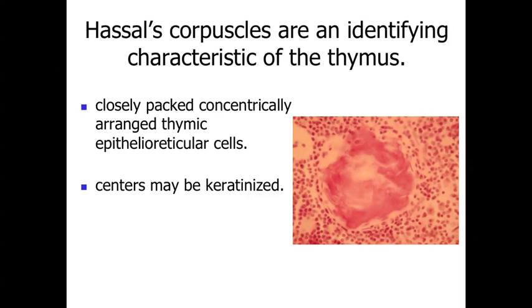One of the identifying characteristics for the thymus is the presence of what are referred to as either thymic corpuscles or Hassall's corpuscles. These are a concentric structure of thymic epithelial reticular cells that come together, cluster together, and in many cases may become keratinized. You start to see these accumulate especially in the adult thymus and at later stages of life, and it may represent a less active form of these epithelial reticular cells.